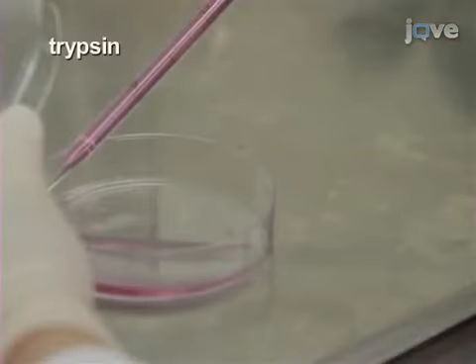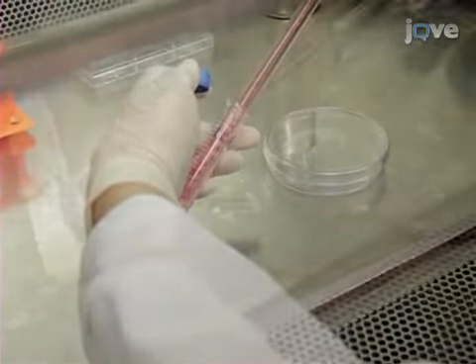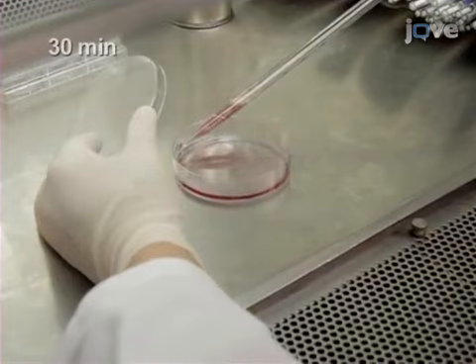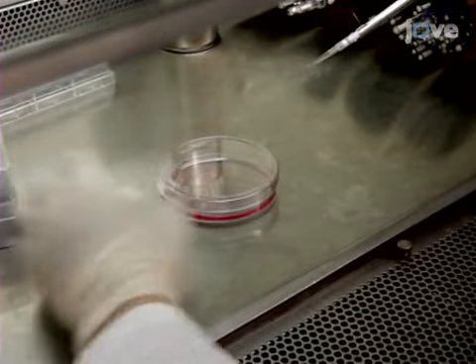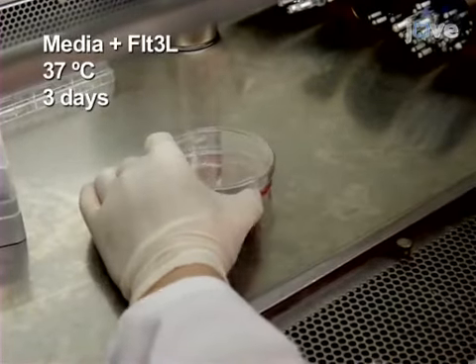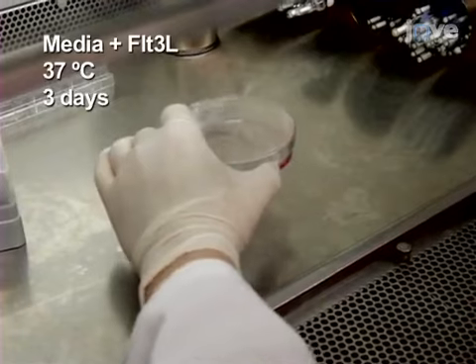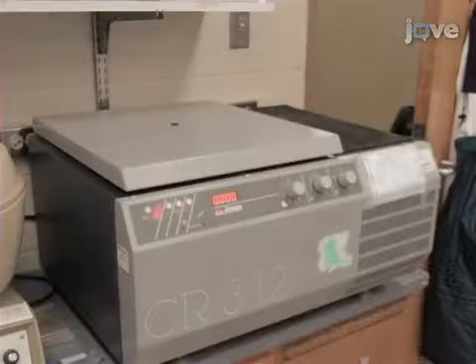On day 5, trypsinize then centrifuge the cells. After incubating them on a fresh 100 mm culture dish for 30 minutes in a 37-degree incubator, plate 5 × 10⁵ of the floating cells in 20% FBS alpha MEM media and mouse FLT3 ligand on a new 100 mm dish containing a monolayer of OP9DL1 cells. On day 8, gently pipette down the loosely attached cells.